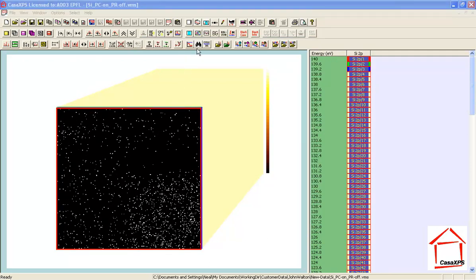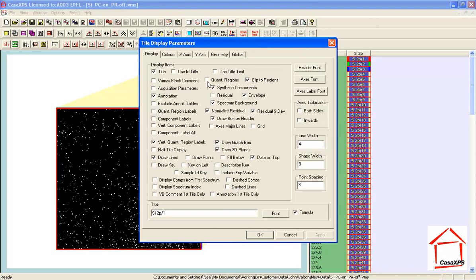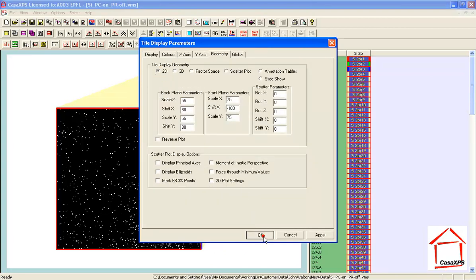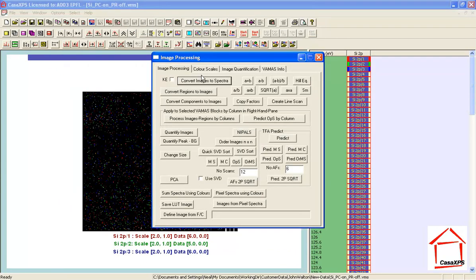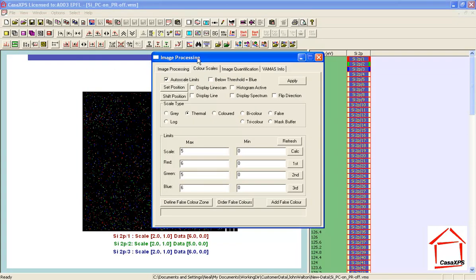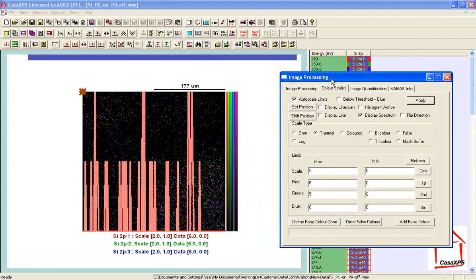The relationship between spectra and images can be further illustrated by observing these images overlaid and enabling the display spectrum option on the colour scales property page of the image processing dialog window. If I tick this box and press apply, we see a marker indicating a pixel, and over the image data a spectrum is drawn showing what a spectrum at a given pixel looks like. At this particular point there is not much signal, so the spectrum is hard to recognise.